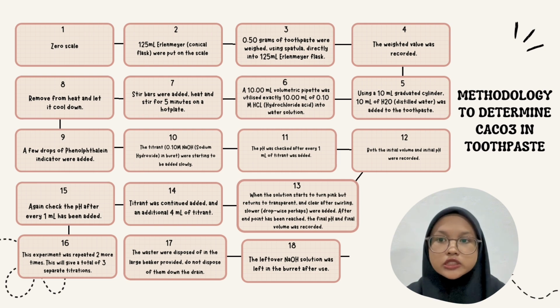17. The waste was disposed of in the large beaker provided. Do not dispose of it down the drain. 18. The leftover NaOH solution was left in the burette after use.